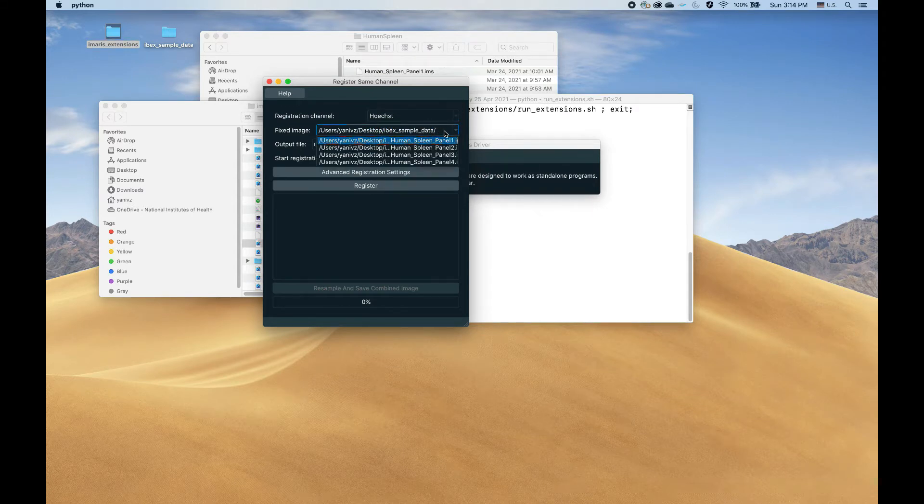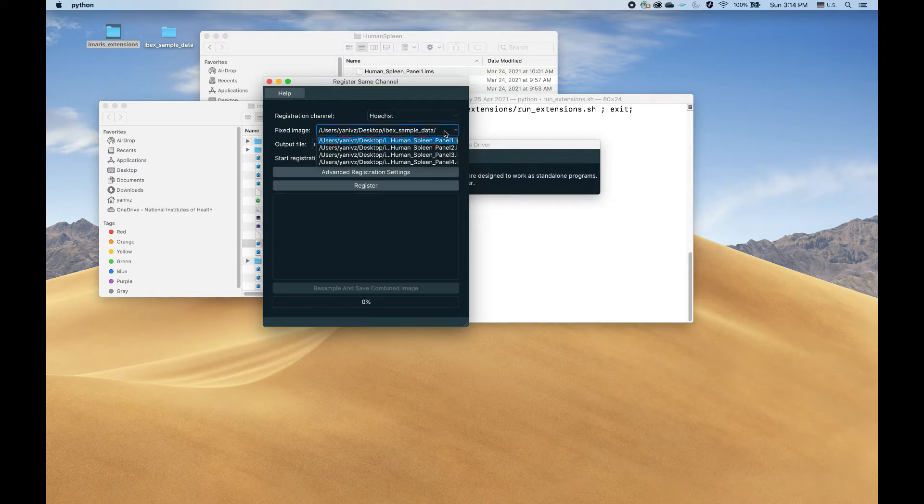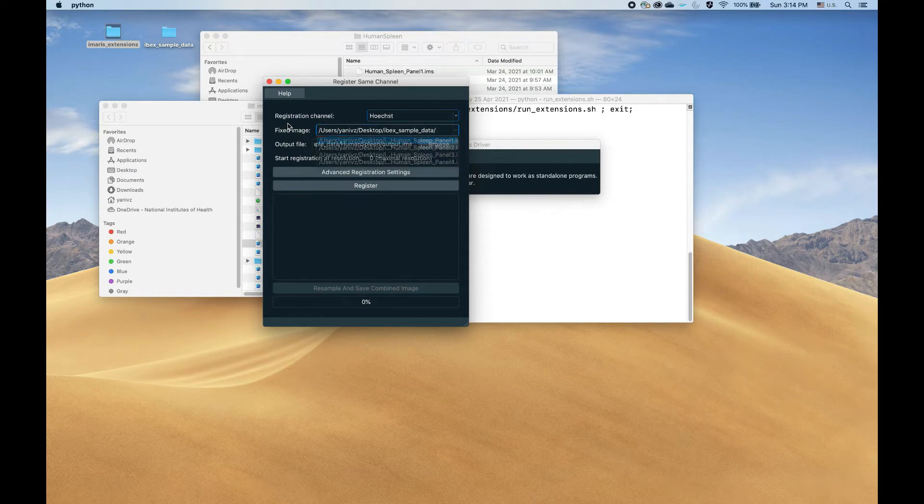Fixed image is the image to which everything is registered. You could leave it by default to whatever it is, in this case panel one, not too critical.